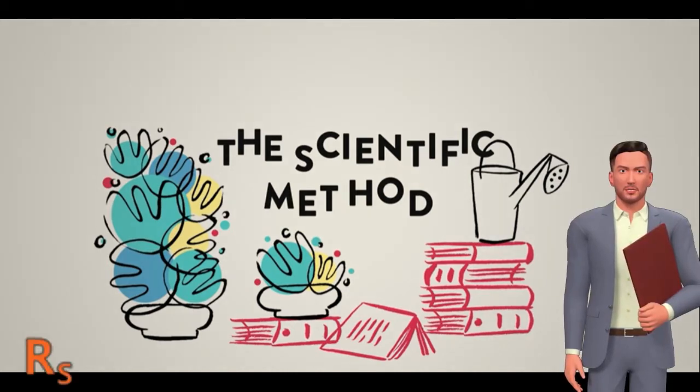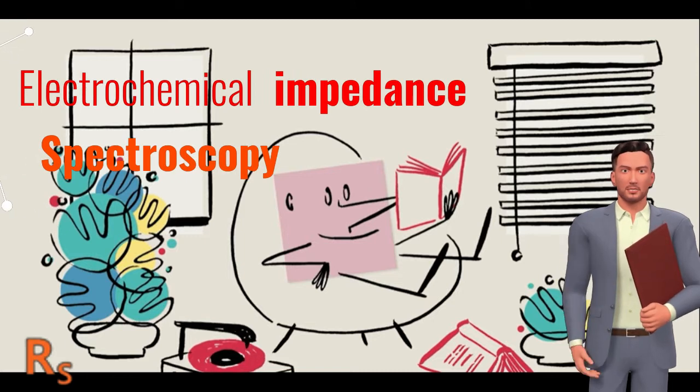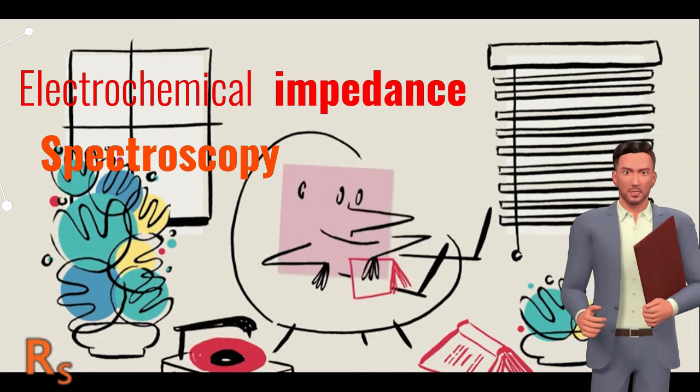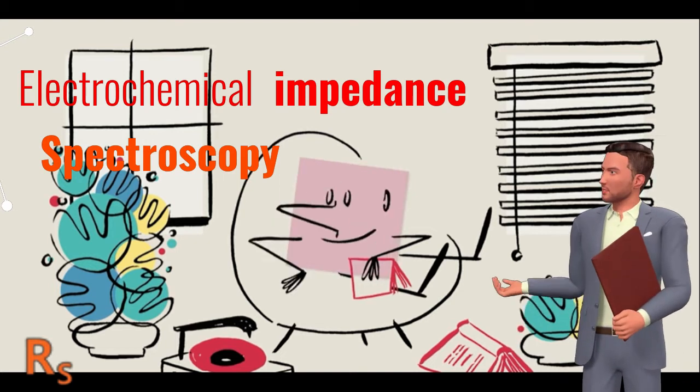Electrochemical impedance spectroscopy. This course will introduce the electrochemical impedance spectroscopy technique and illustrate its use to characterize electrochemical processes. Details regarding the correct method of data acquisition and analysis, along with pitfalls to watch out for, will be discussed.